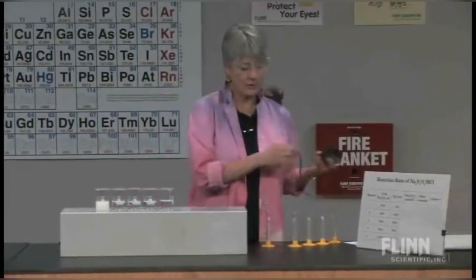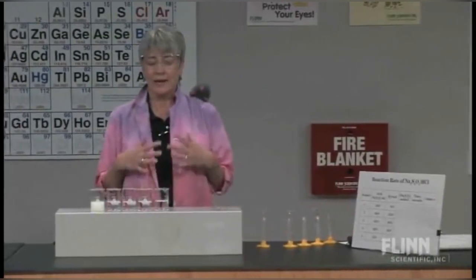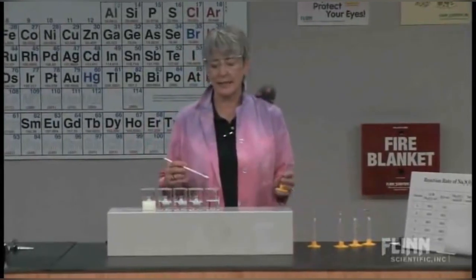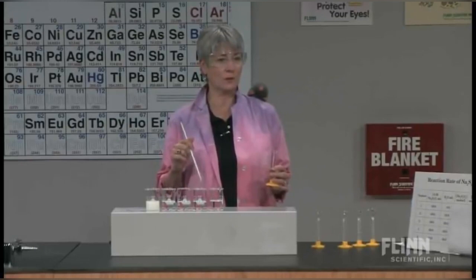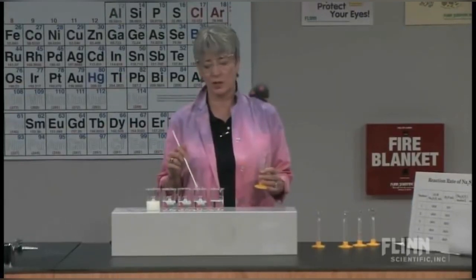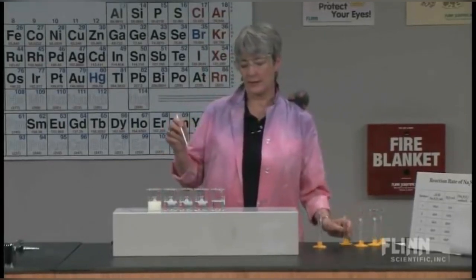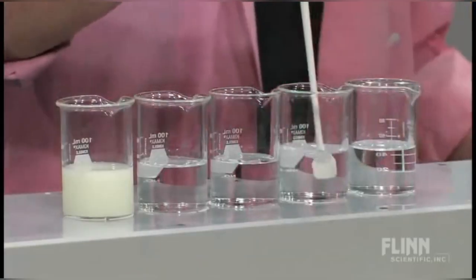I'm not going to do the whole experiment for you, but what the students would usually do, if I have them do it as a lab, is they'll do each part. And I always warn them, start the last one early, because it's going to take longer for that last one to change. And what we do is we start measuring. We put the other ones in.